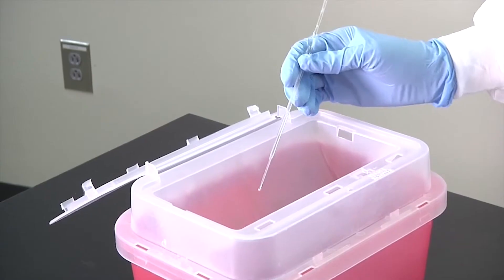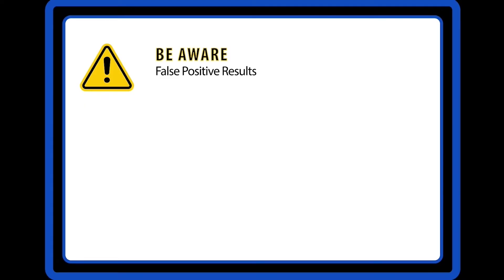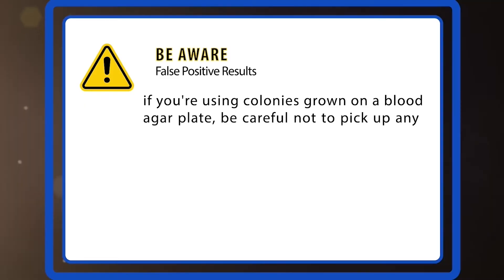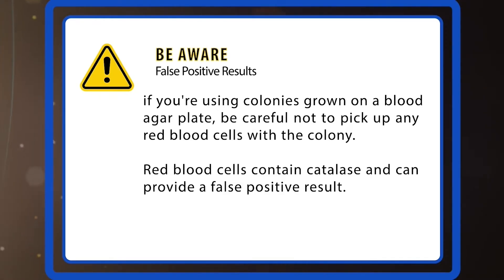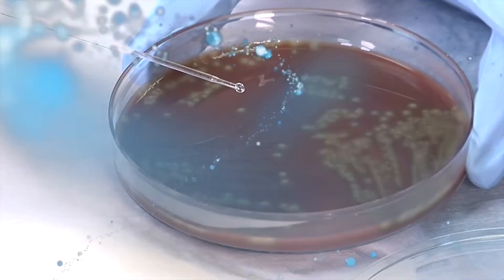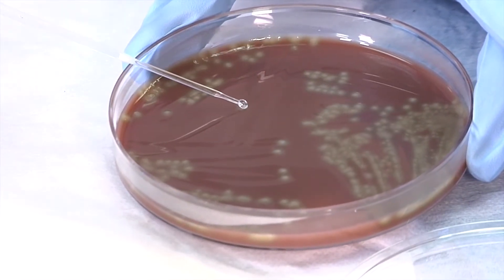Then discard the stick or loop into a sharps container. Remember, if you're using colonies grown on a blood agar plate, be careful not to pick up any red blood cells with the colony. Red blood cells contain catalase and can provide a false positive result. Repeat the process with your negative control.